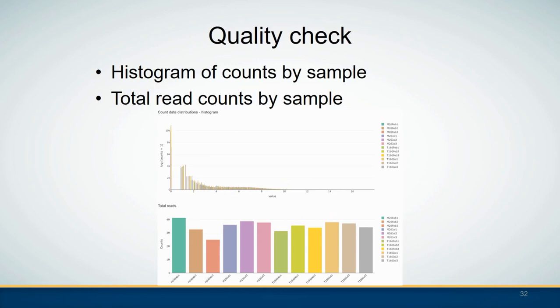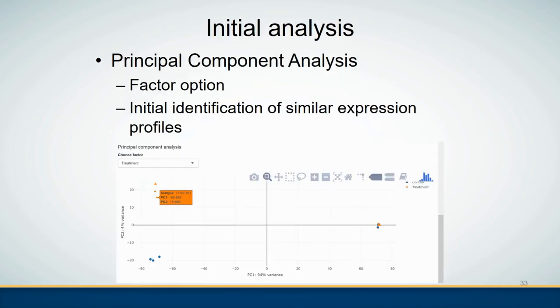IRIS also provides a histogram of counts by sample to explore the distribution of the counts, as well as the total read counts by sample. Some preliminary analysis tools are also provided — for example, principal component analysis can be performed to initially identify similar expression profiles as well as potential outliers from the dataset.